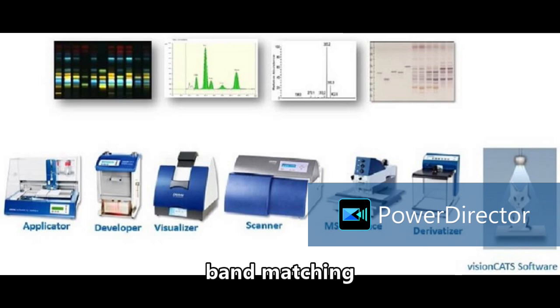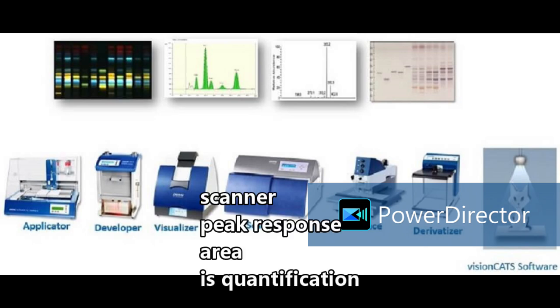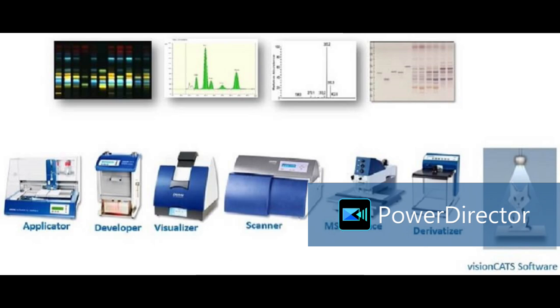After knowing the RF value, we want to quantify how much it is. So our scanner will generate peak response and area for that particular separated band, and that area is proportional to the amount of the separated band. Here detection is done in solid state. On the plate, samples and standards are in solid form. We keep it in the scanner, and the scanner moves light over the solid chemical components, and based on their absorption properties, it will generate peak area.